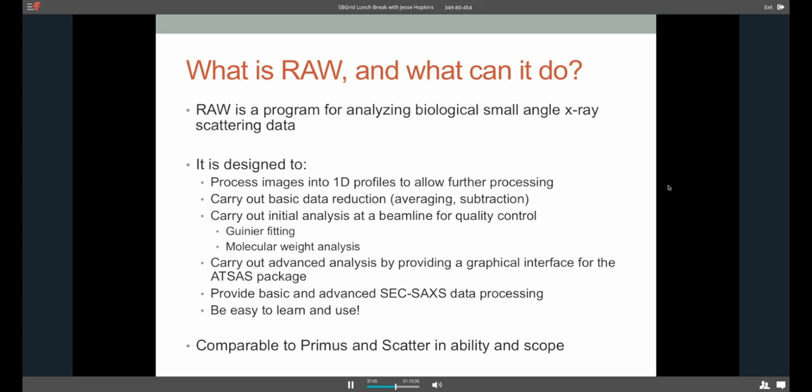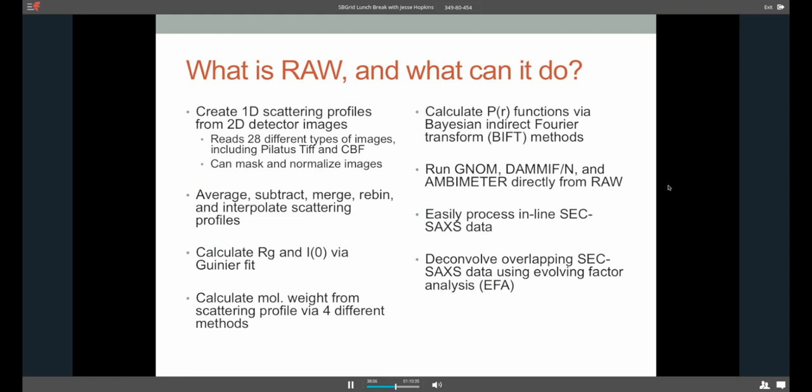In addition to those, it also provides basic and advanced data processing for size exclusion coupled small-angle X-ray scattering. And again, I'll demonstrate that and talk a little bit more about what that technique is in a few minutes. The other thing I wanted to mention is that RAW is really designed to be easy to learn and use. That's one of the key features of it. And hopefully I'm not tooting my own horn too much by saying that I think it really is. For those of you who are familiar with small-angle X-ray scattering analysis, the program you should really be thinking of it kind of like Primus or Scatter in terms of what it can do and the different kinds of things it can do. So a little bit more detail then, digging down to this. So when we're working with detector images at the moment, we can handle 28 different types of images, including the standards that you'd expect, Pilatus, TIFF, CBF, EigerFiles.